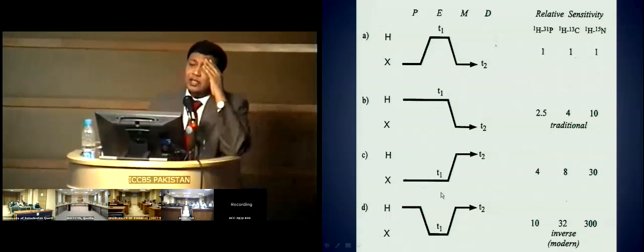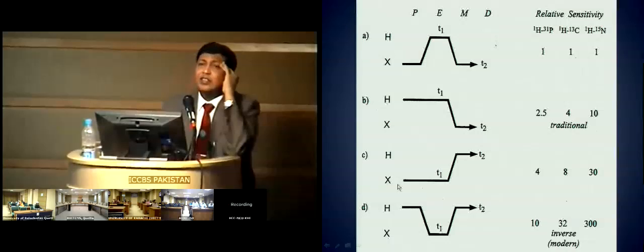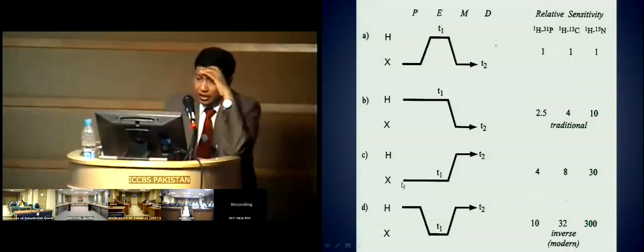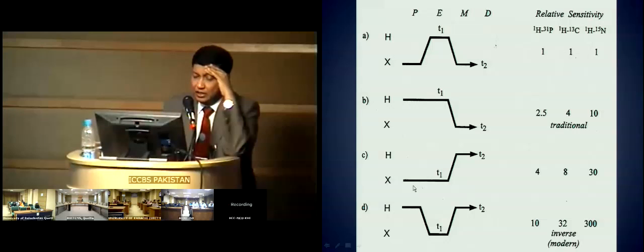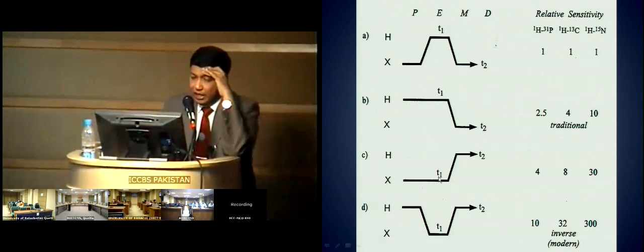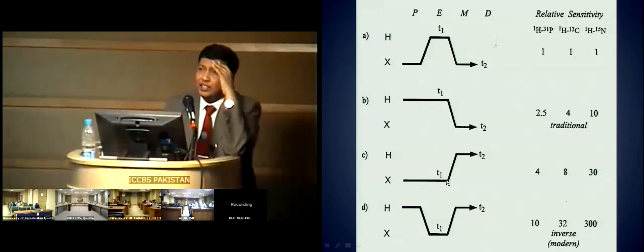This is different. This is a traditional inverse. When Muller first discovered this, it was again a contribution of Muller. He said, can't we do it in a very reverse manner? Instead of this, shall we do it like this, that the source is a carbon. We do 90x, let it split into two components because it is a scalar coupled carbon, and then when it becomes antiphase, transfer the polarization to proton and detect the proton.